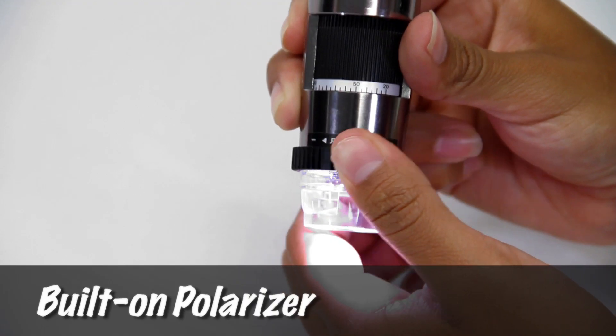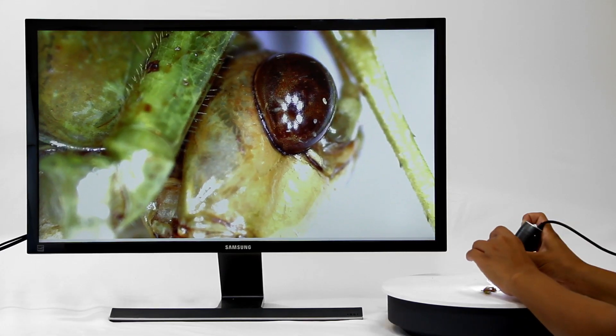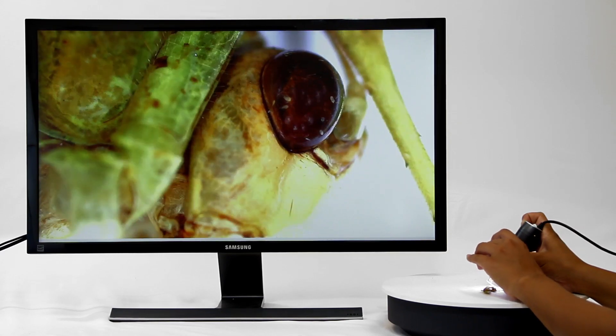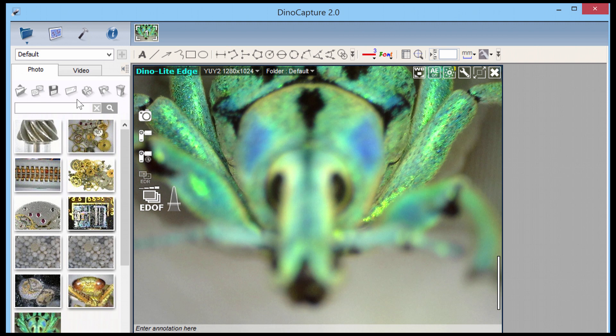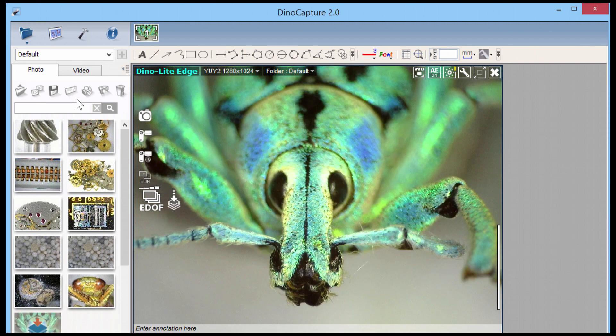Some models have a built-on polarizer that helps provide great clarity in imaging. EDOF, or Extended Depth of Field, is a very popular feature for compatible models that provides simple one-click focus stacking.